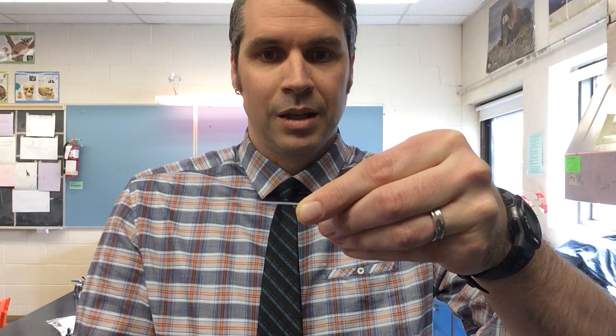Now get your cover slip and very carefully take it and lean it down over top — it's going to squish. You now have made a cheek cell slide. Put it on your microscope and look at low power and find your cheek cells.